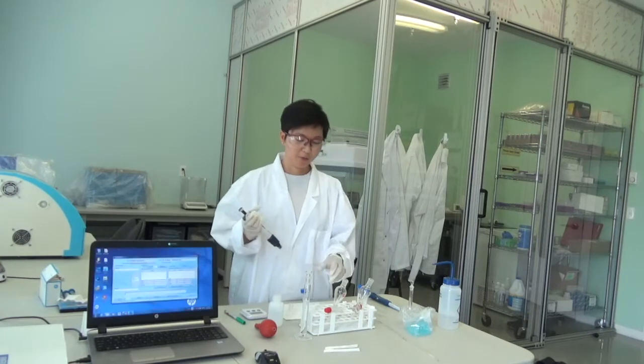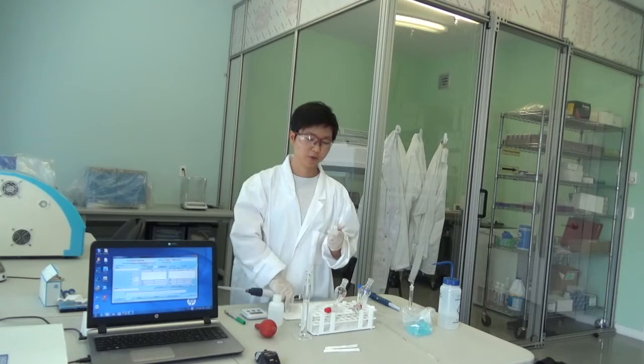Demonstration of anionic surfactant analysis using the Fluorat fluorescence analyzer. First, we need to add 5 ml of the sample into a separating funnel.